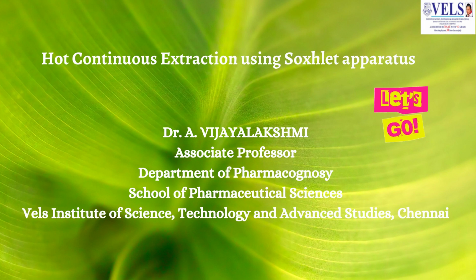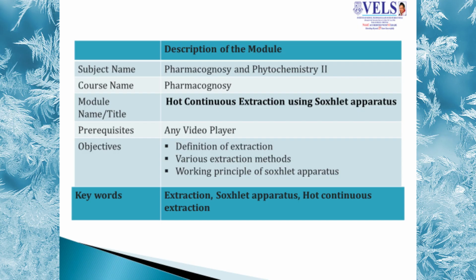Hello everyone. In this module, I'll be discussing hot continuous extraction using Soxhlet apparatus. So in this module, I'll be discussing the definition of extraction and various extraction methods, both conventional and modern extraction methods, and a detailed note on the working principle of Soxhlet apparatus.